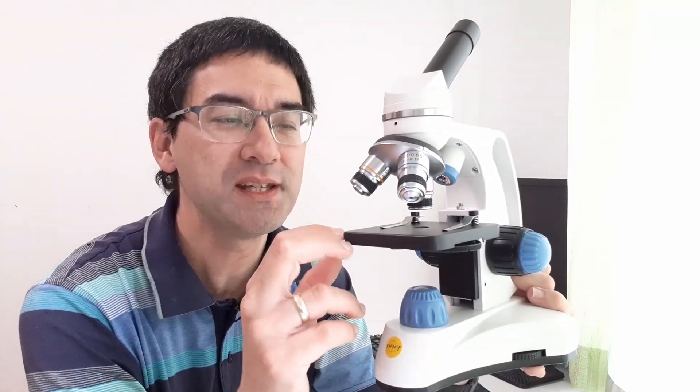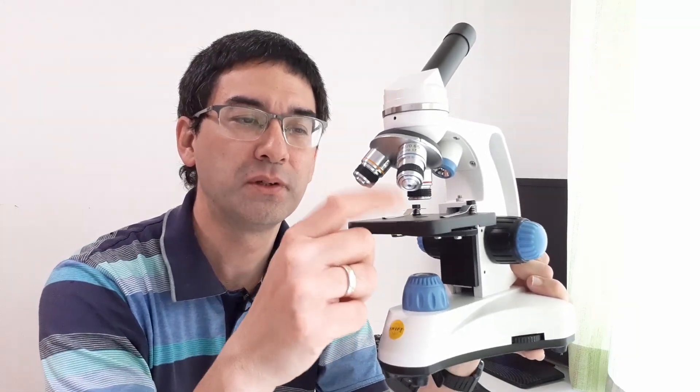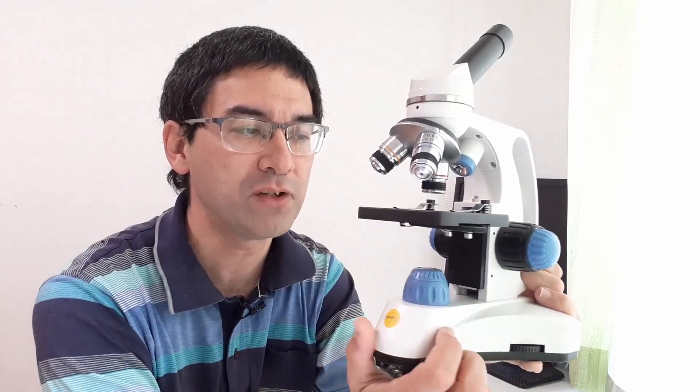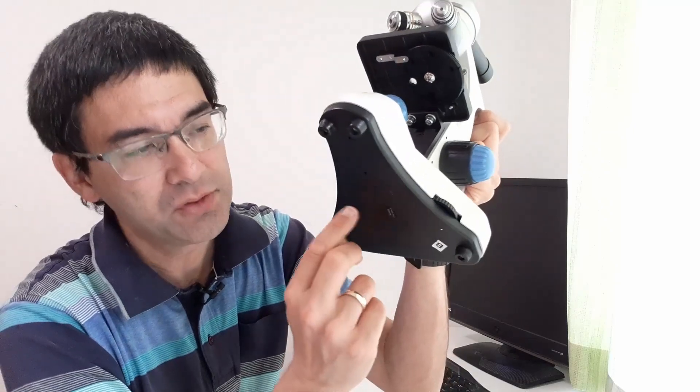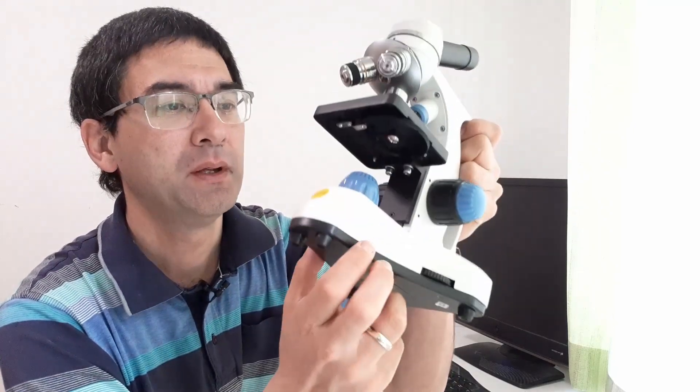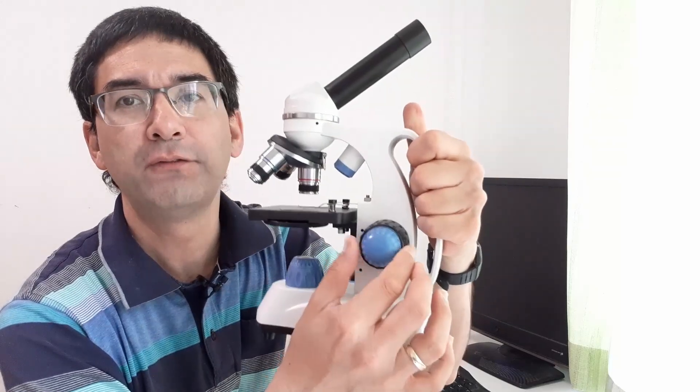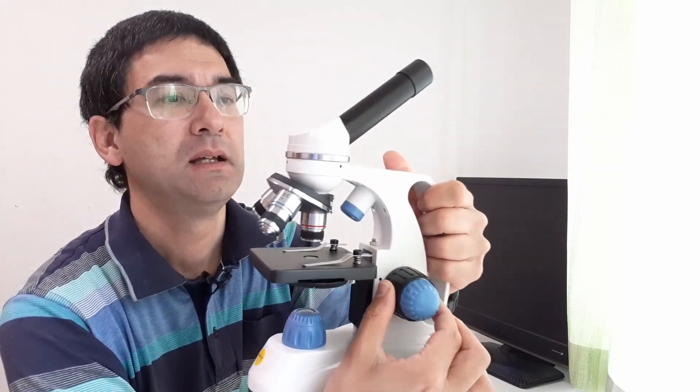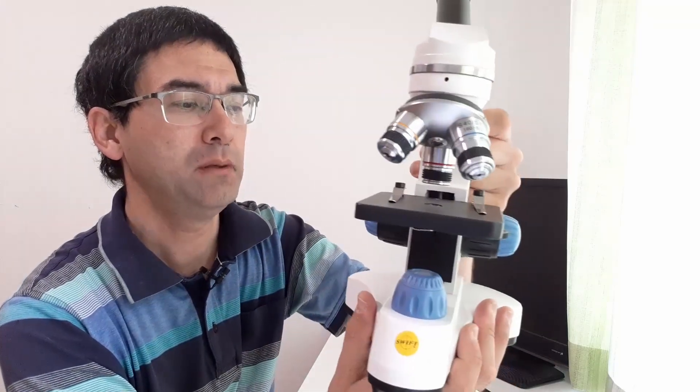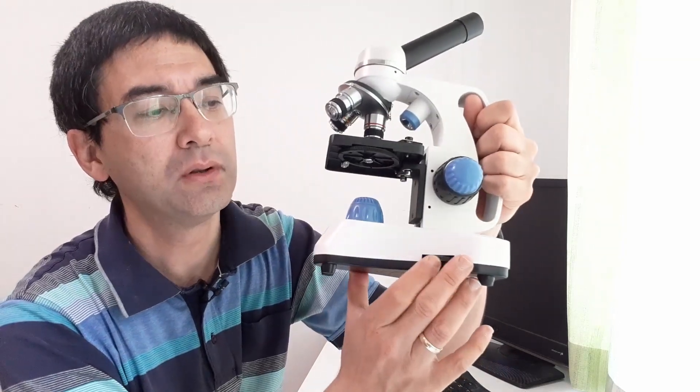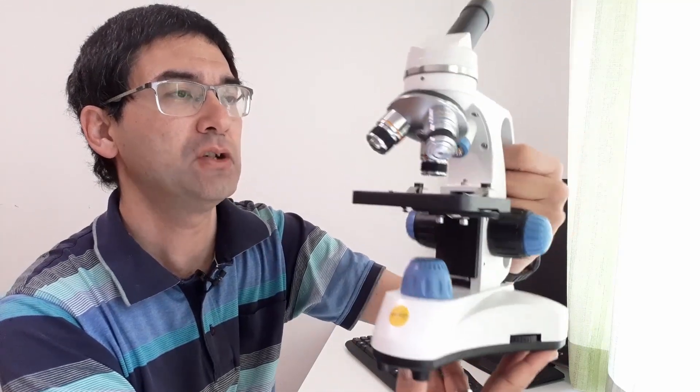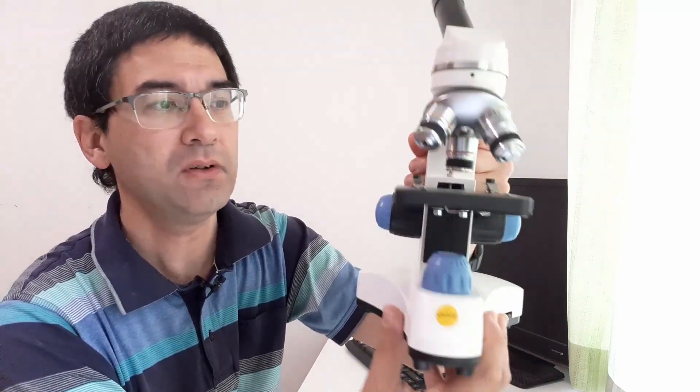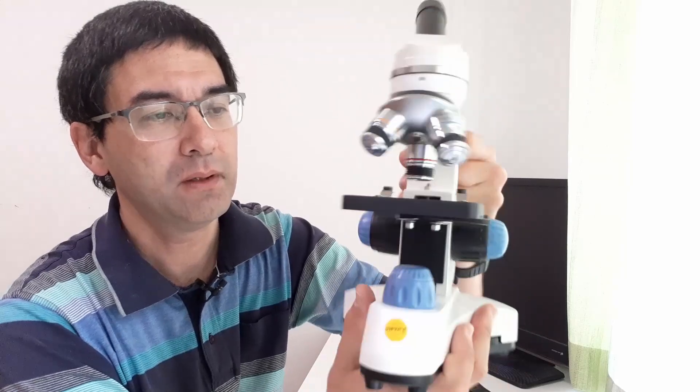It makes it also more scratch resistant, especially if you have microscope slides with sharp corners. The bottom part here, that is plastic. There is also a little battery compartment here. The lamp is plastic. The coarse and fine focus knobs, they are plastic. And the wheel here for adjusting the brightness is also plastic. So you see that mostly it's metal, so it makes a very solid impression.